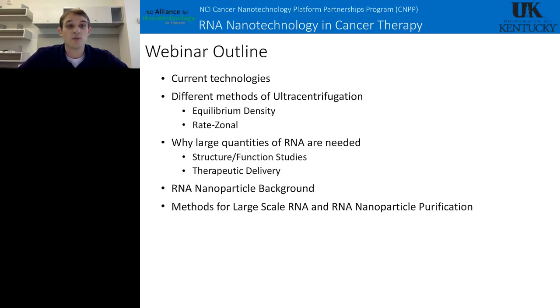And then I will go into some of the current technologies that are used to purify RNA, some issues with those technologies in my opinion, and how we can improve them by using ultracentrifugation. Then I'll talk a little bit about the different methods of ultracentrifugation.